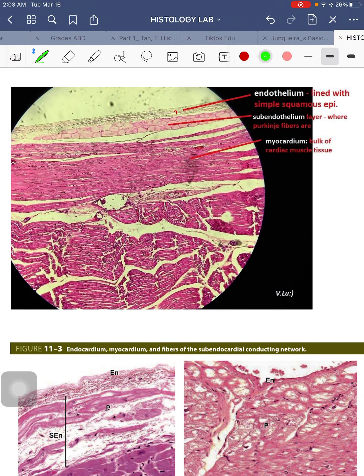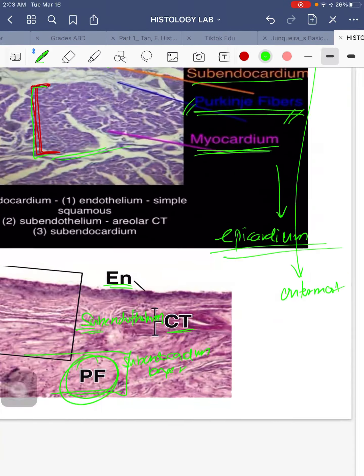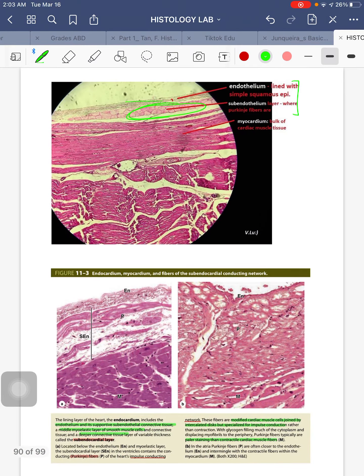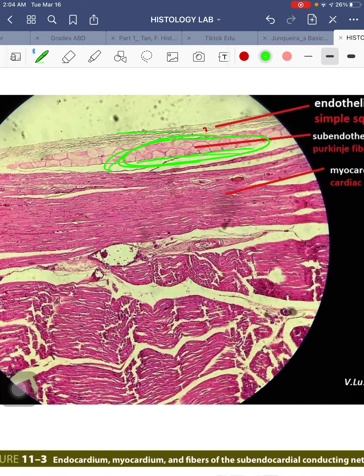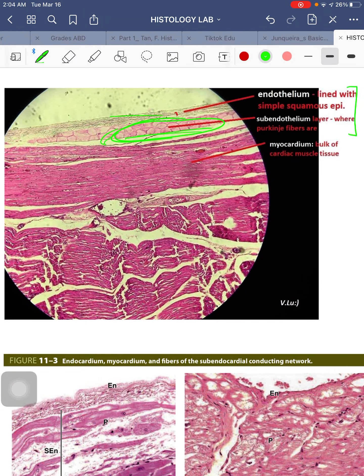This is another picture from a different lab showing the same structures. Again: your endothelium is the innermost layer, part of your endocardium, lined by simple squamous epithelium. Below that is your subendothelium layer, and here you will come to appreciate your Purkinje fibers — very similar to the ones in the textbook. Purkinje fibers are located specifically in the subendocardial layer.